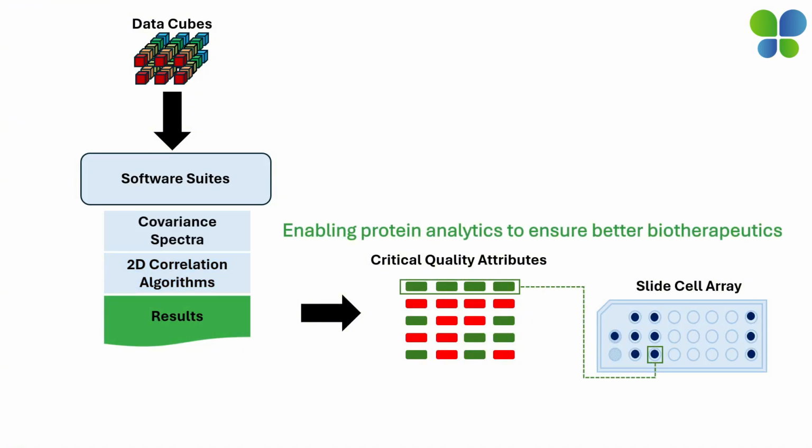A comprehensive analysis describing the relationship of multiple critical quality attributes can also be performed to de-risk preclinical candidate selection, accelerating speed to market and ensuring safety and efficacy for patients.